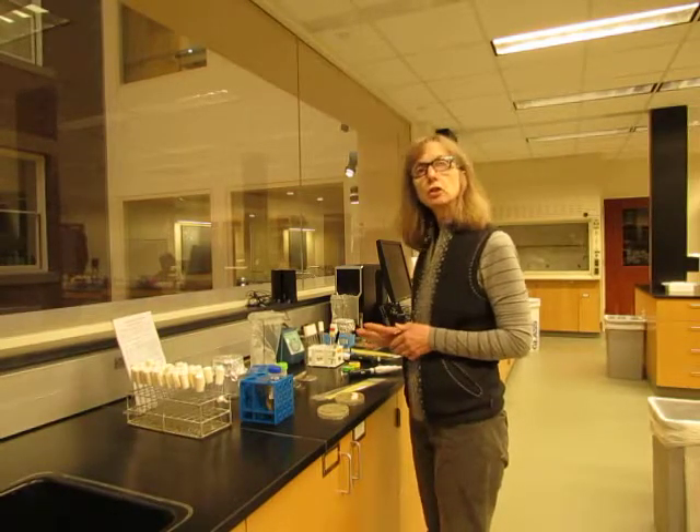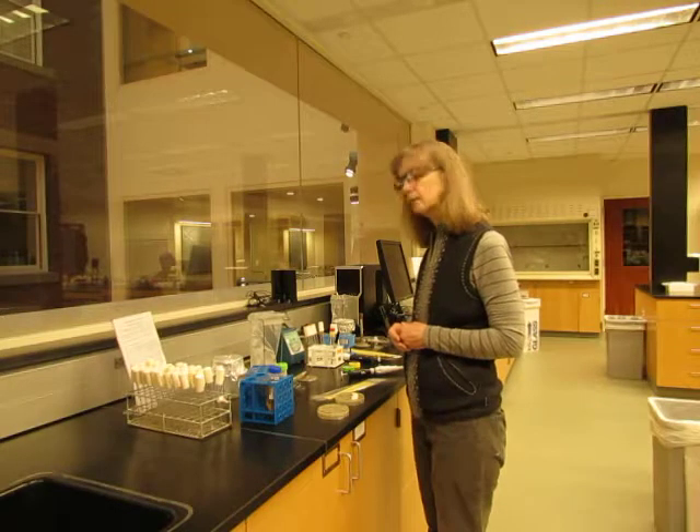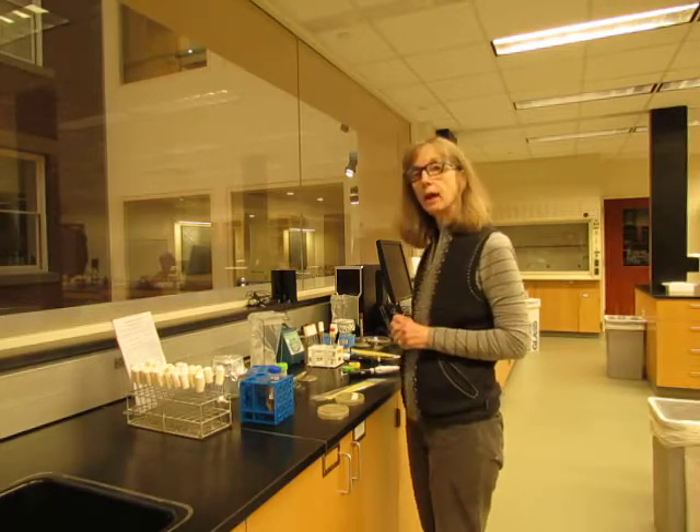I'm going to start some yeast cultures — some liquid yeast cultures for use in your experiments — and I'm going to go through the procedure on how you should do that.